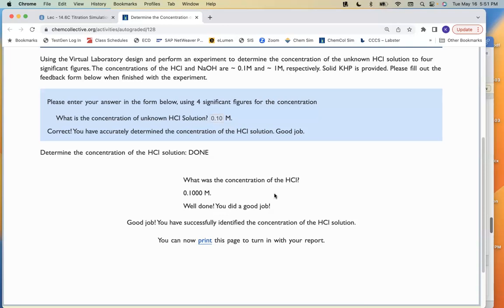You're basically doing experiment 17 using a simulation. If you have questions, please do not hesitate to ask. Please come to my office hours. I will show you, and then I can hold Zoom sessions to help you with this, because it's actually really easy to hold a Zoom session and show you how to get any of these done. So please let me know if you have any questions. This ends the tutorial, and then we're going to do the actual experiment when we are done.